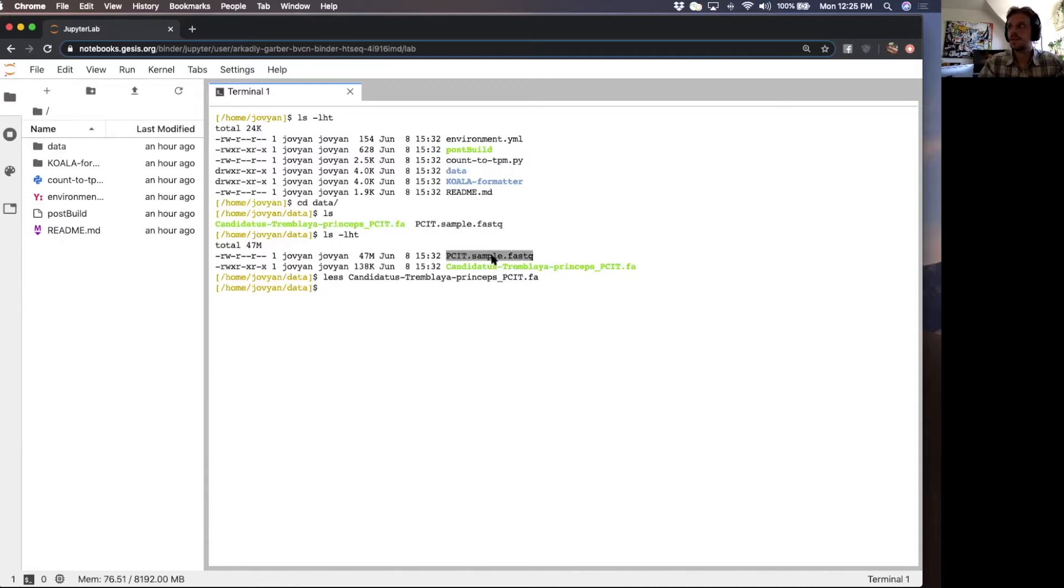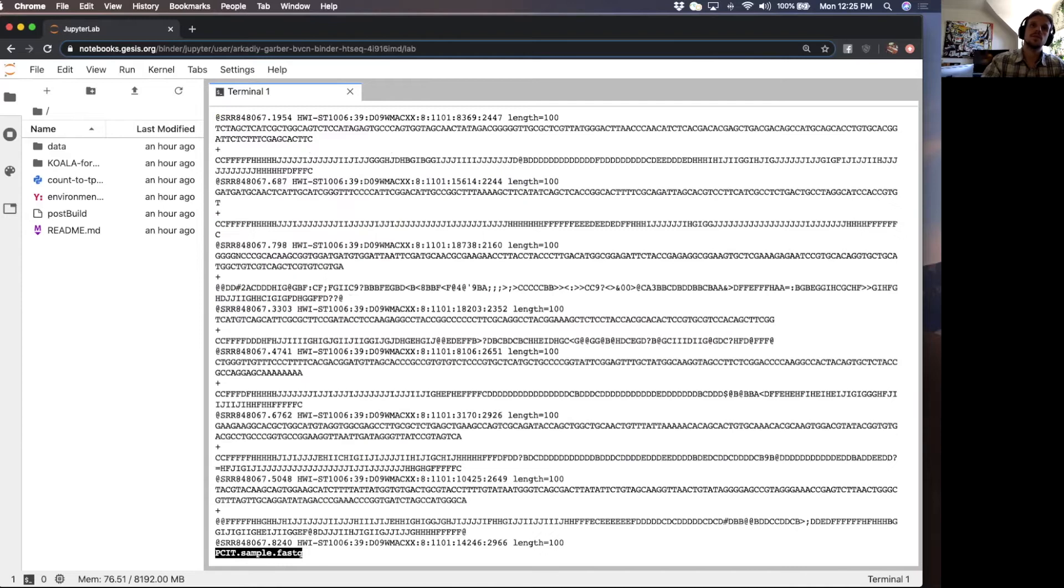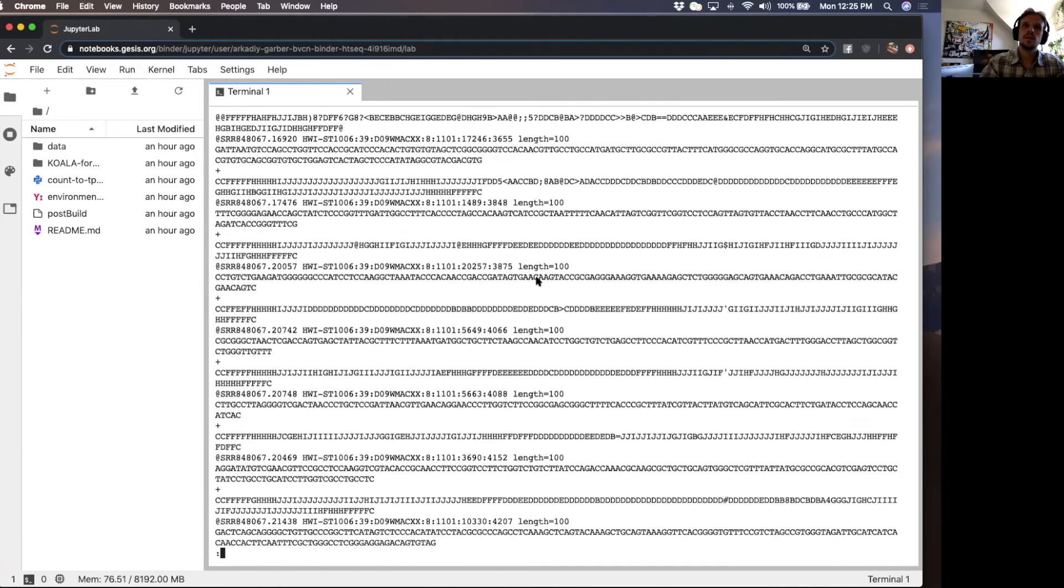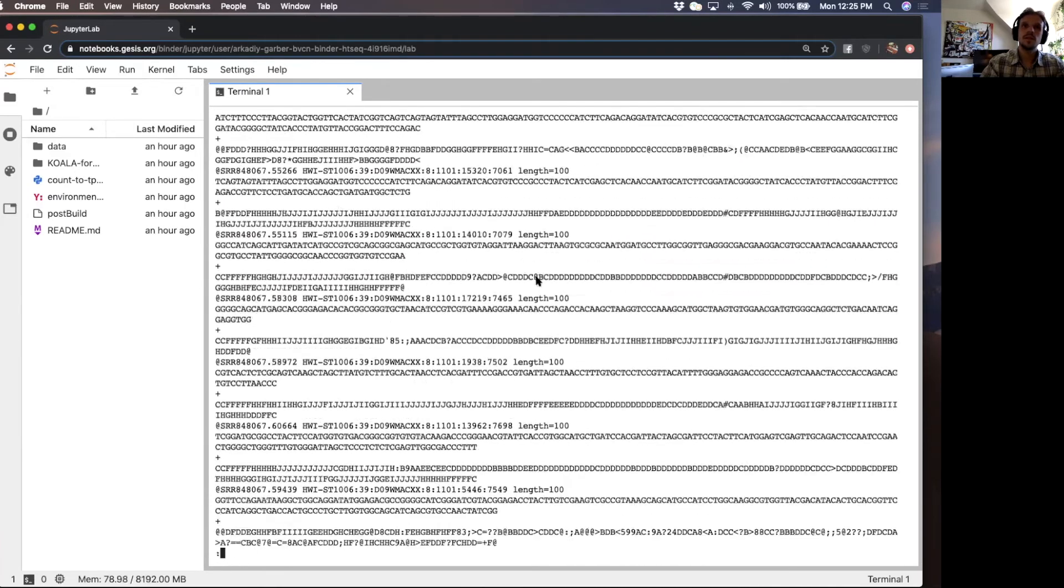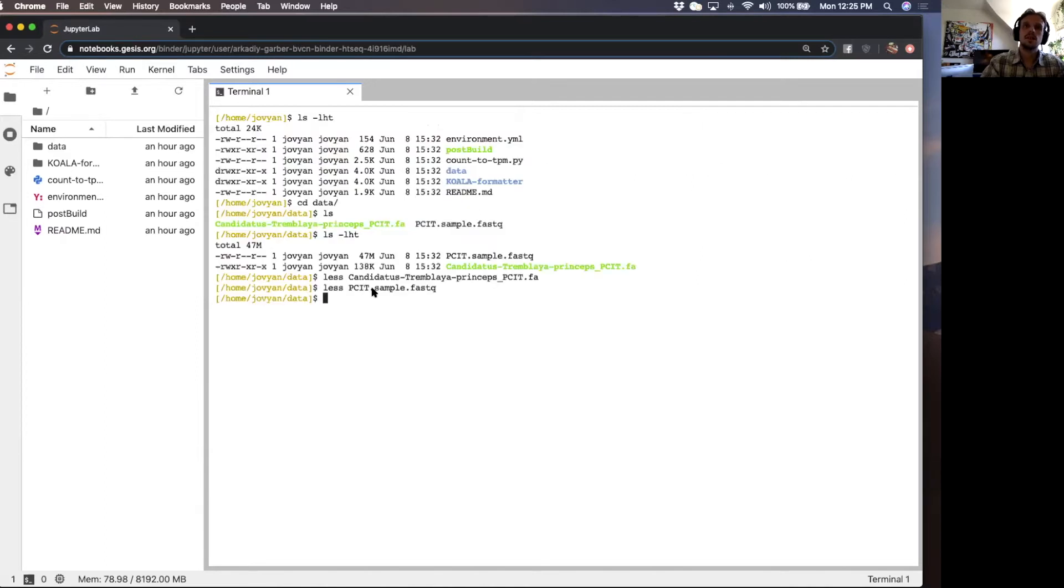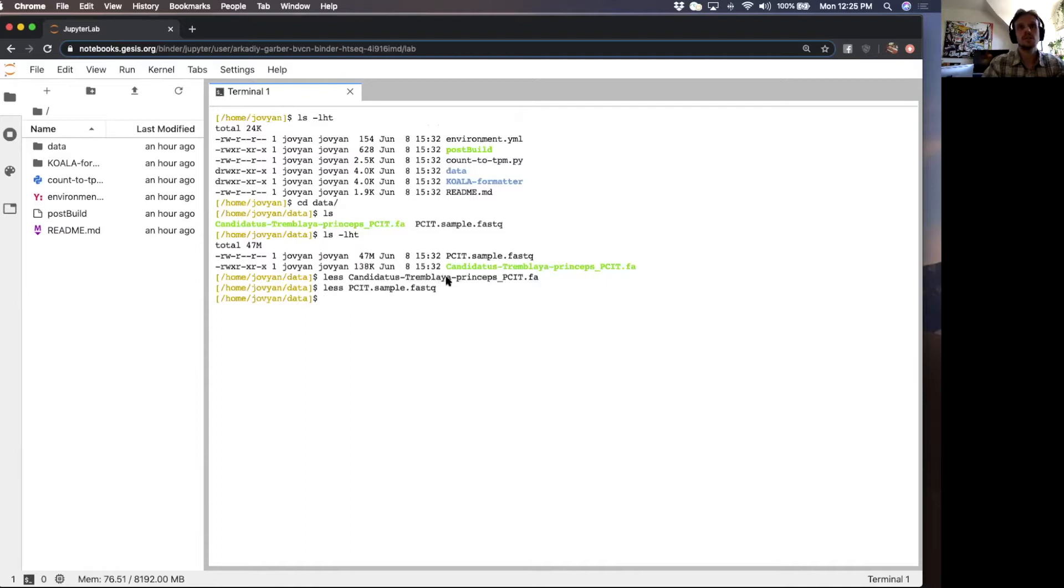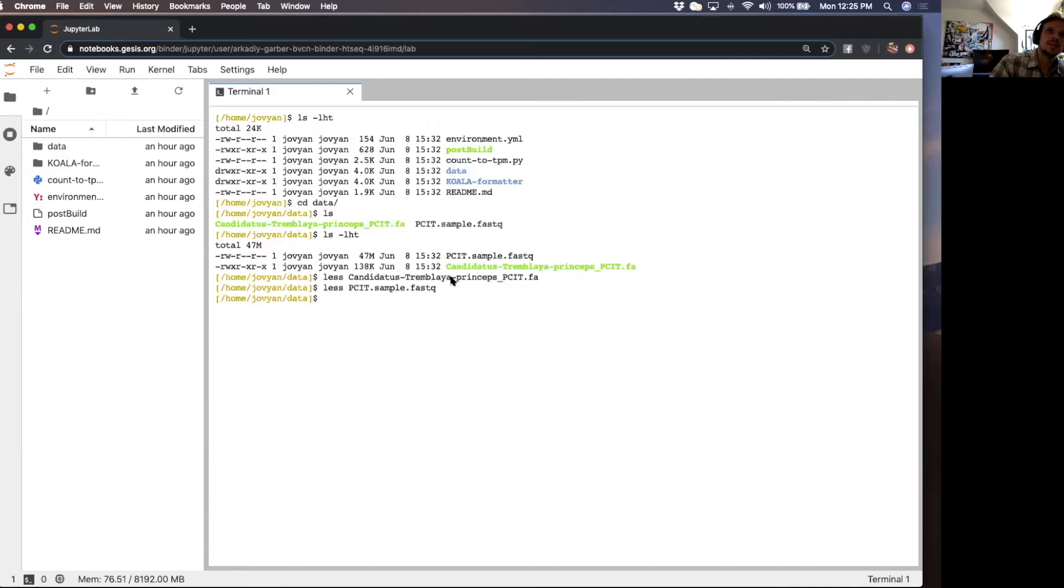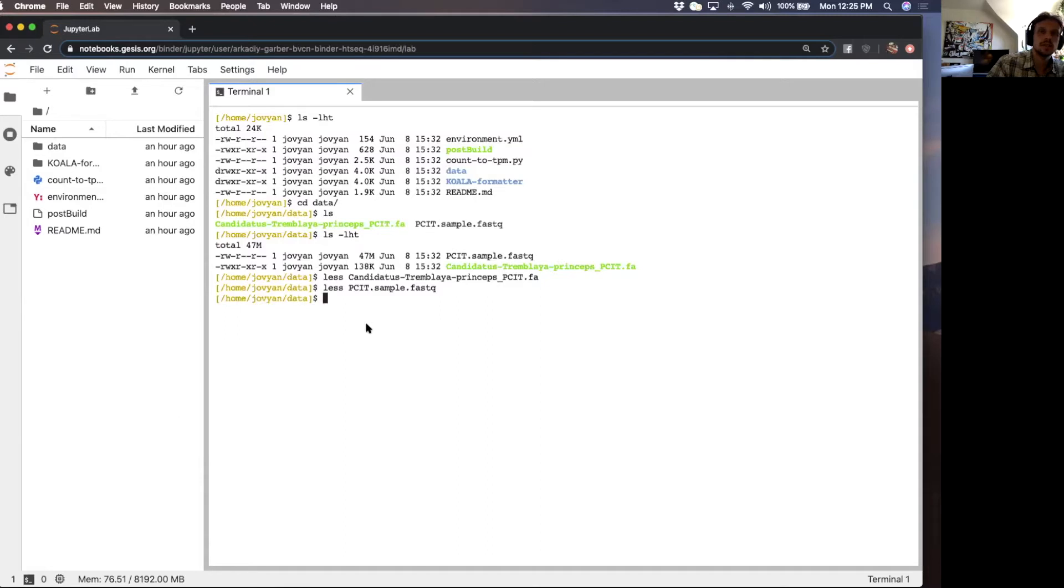The second file that we see here is reads from an RNA-seq experiment. As you can see, this is a FASTQ file where you have the header, gene sequence, and then you have the quality score. This RNA-seq data is from the insects. These endosymbionts reside in a specialized organ within the insect called the bacteriome. In this experiment, the bacteriome was harvested and then RNA was extracted and sequenced.